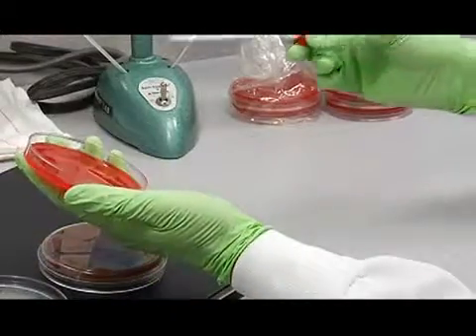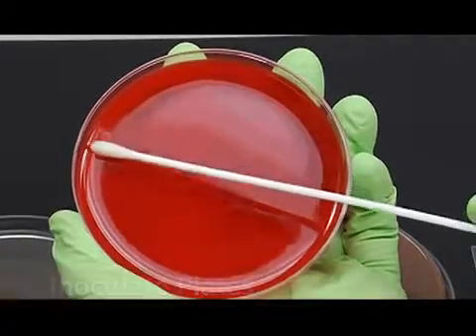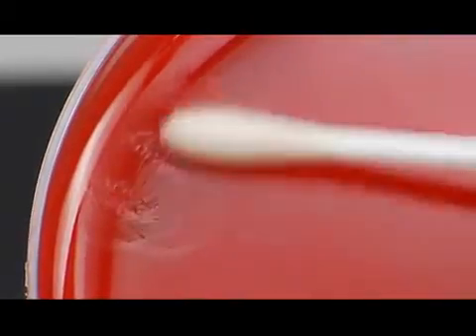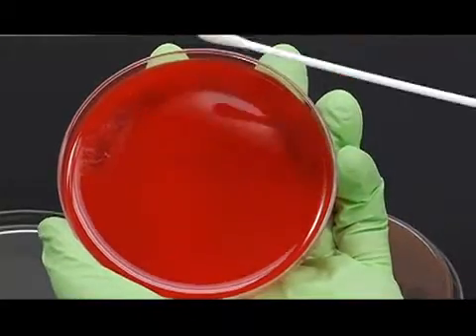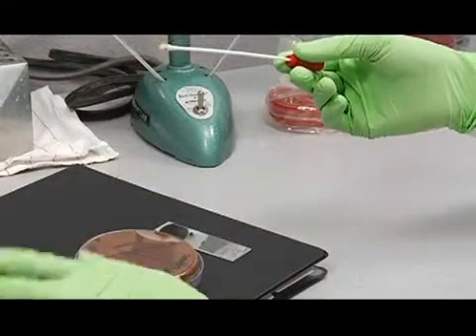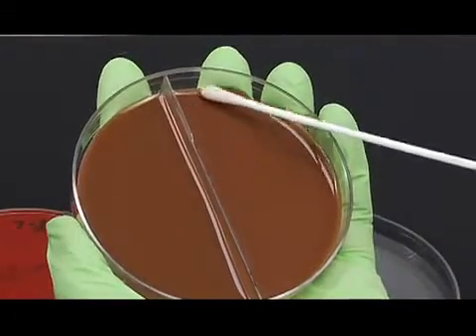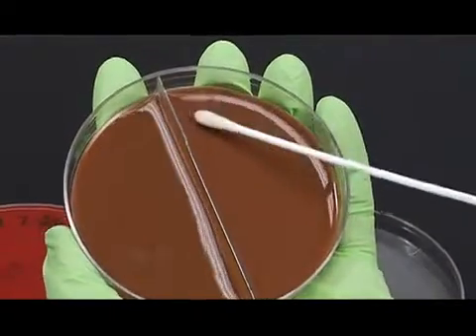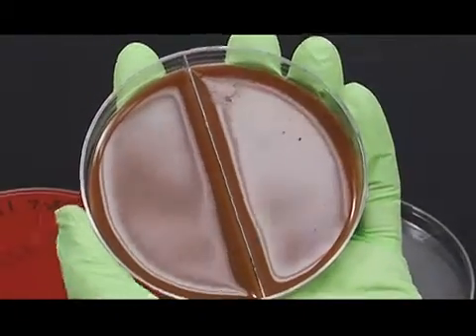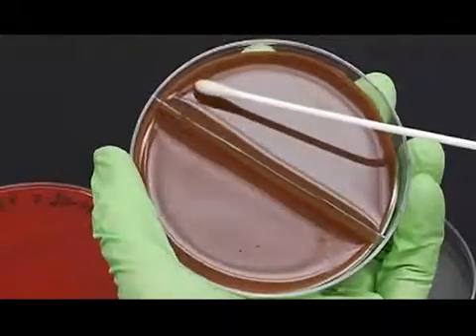So then inoculate your plates. You're going to hold the plates like this, and then you want to make kind of a nickel-sized area of inoculum on here like this, and I kind of roll the swab as I do that. So we want an area about this big. And you go on and do the same with the rest of the media. So I'm going to do the chocolate side here like this, and the Martin Lewis side right there.